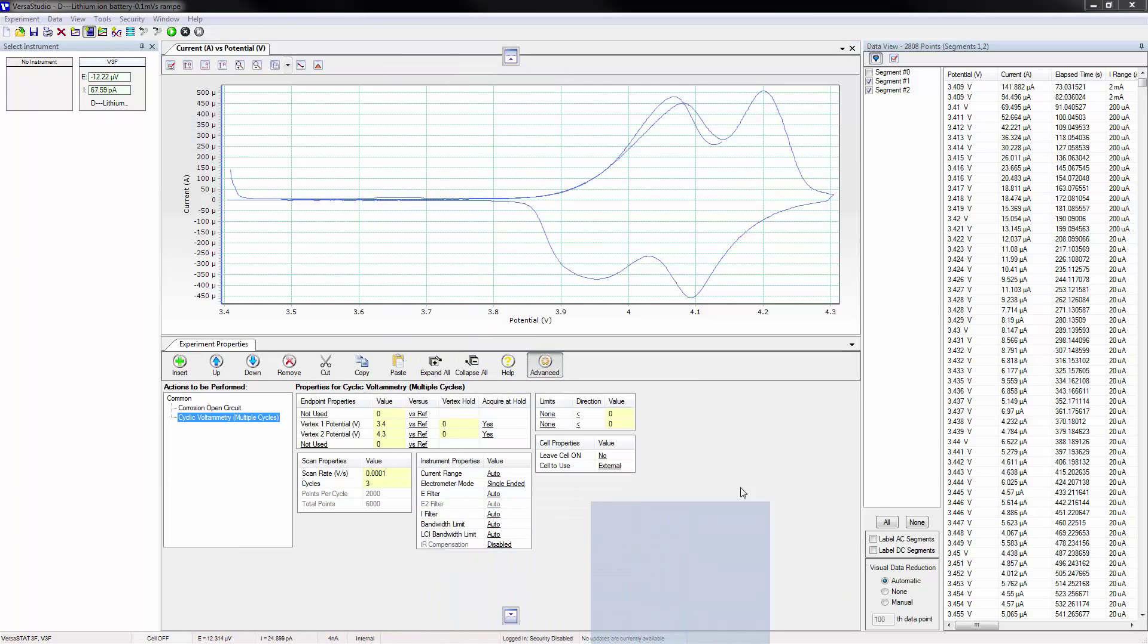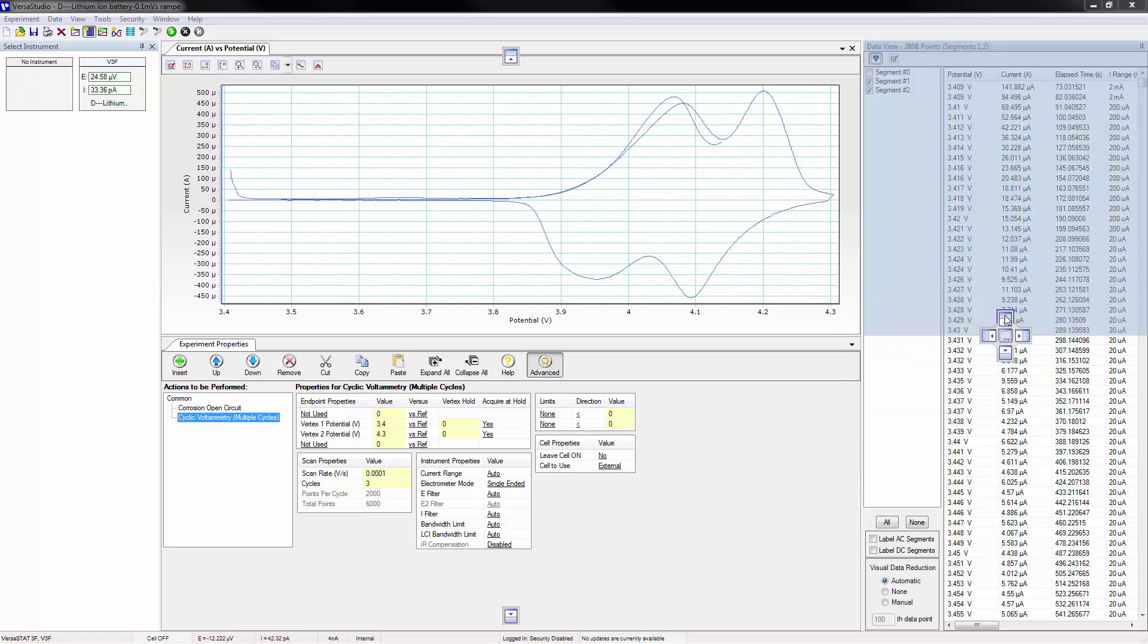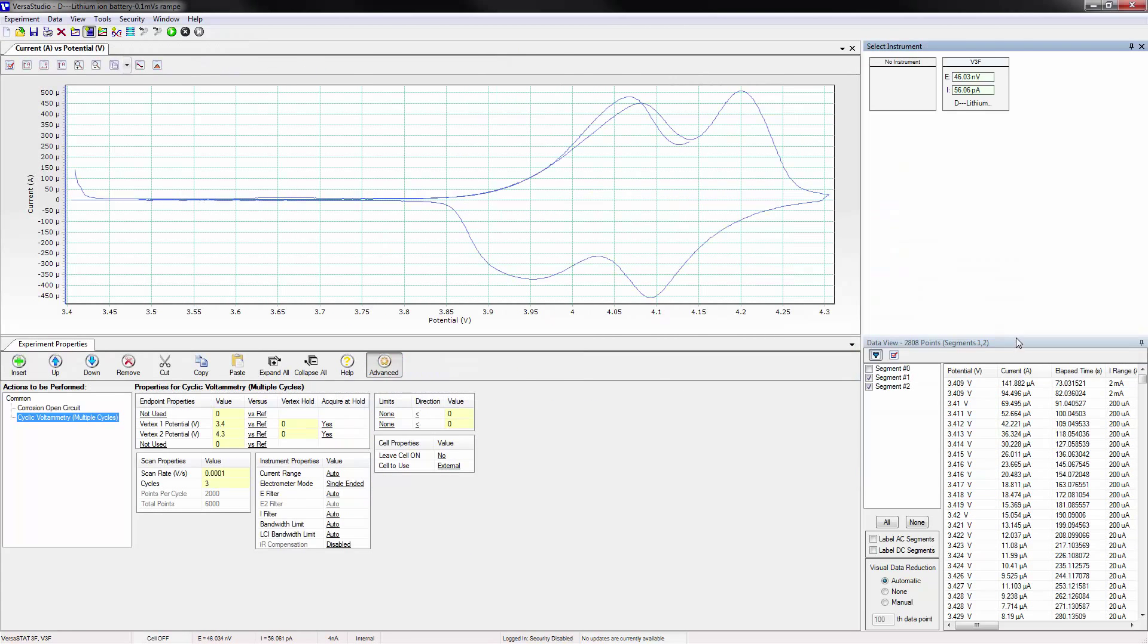Or combined with the data view window. In this case, we'll place it above the data view window, and then resize that window again.